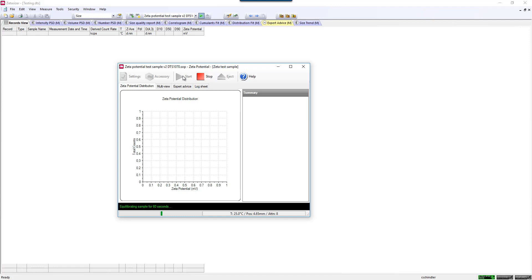Your measurement would then proceed, and once it's finished, you would see a record pop up in your record view.